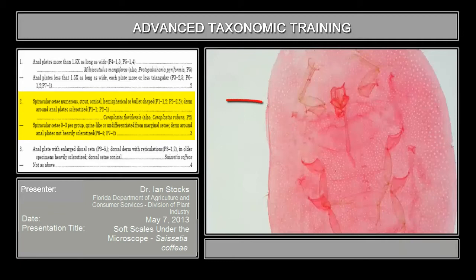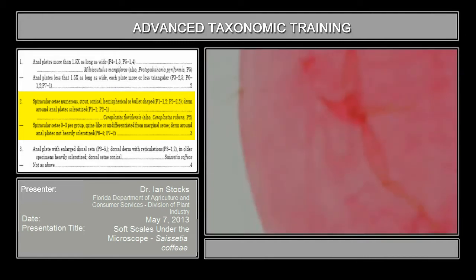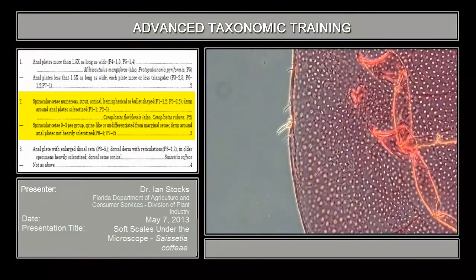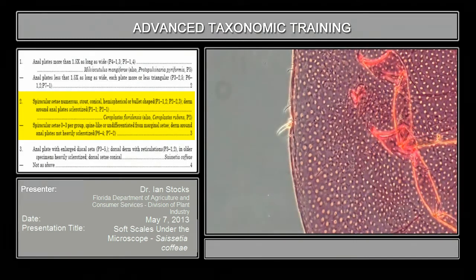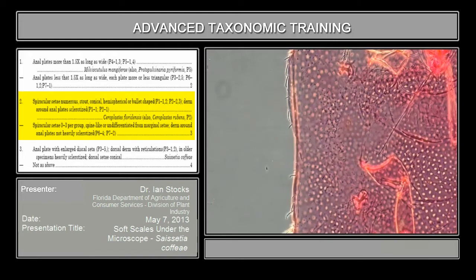But once you get here to the spiracular margin, you can just about perceive that the setae are a little bit different. They're broken off there, but in the projected image, if I go up to the posterior spiracle and go up in magnification, you can see this is an example of a species that has a very modified set of spiracular setae. There's the pair of similar ones on either side of a greatly elongated one right here. And they are substantially distinct from the remainder of the marginal setae, which are more or less just straight rods with a little bit of fringe at the tip. Okay, but we'll go back down in magnification here.